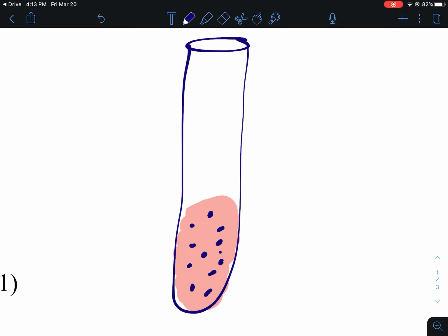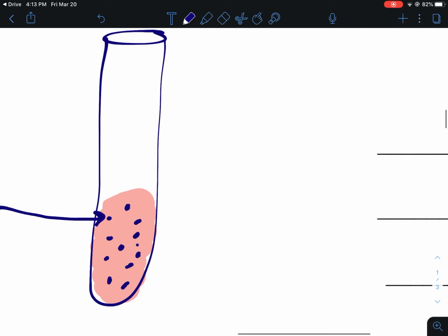So let these blue dots represent crystallized water, okay? That is water that was once part of the solution, solvent that was once part of the solution, that has now crystallized out of solution, and it's now a solid. If you remember back, the definition of a solution is a homogeneous mixture. It's evenly mixed. If we are looking at these crystals of ice, you can ask yourself the question, are they part of the solution anymore? And the answer would be no, they're not. Since that water has crystallized out, they're no longer part of the solution.